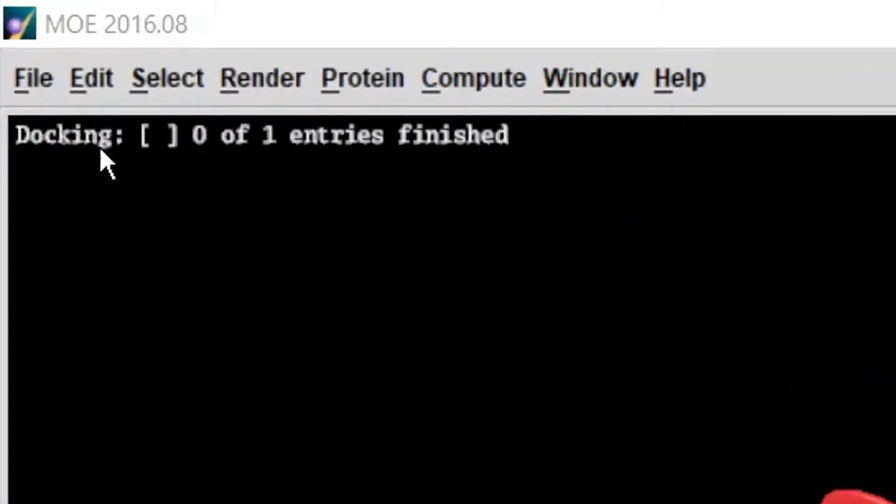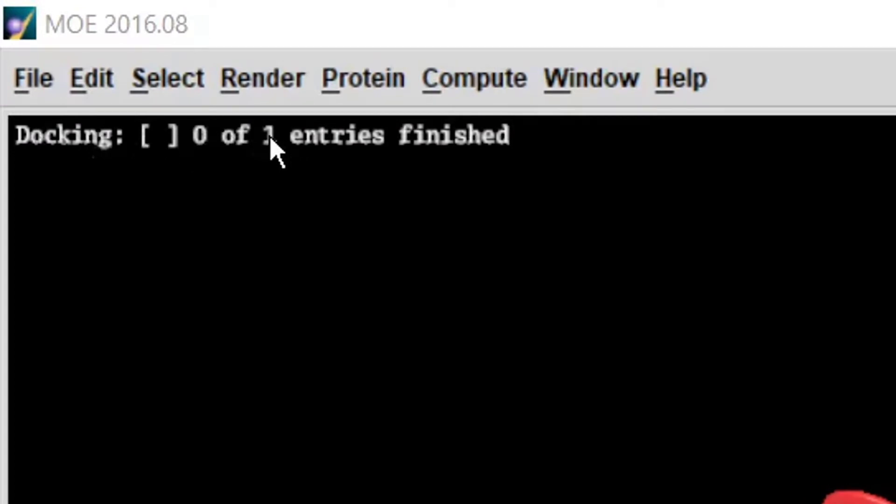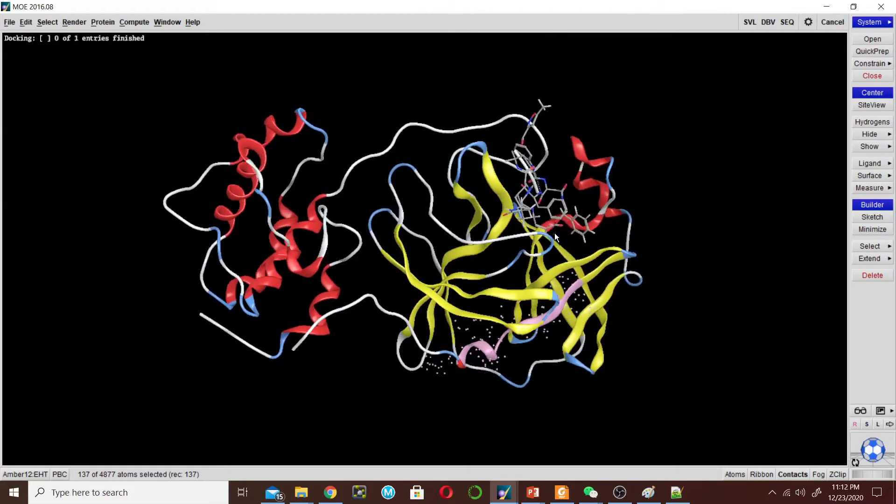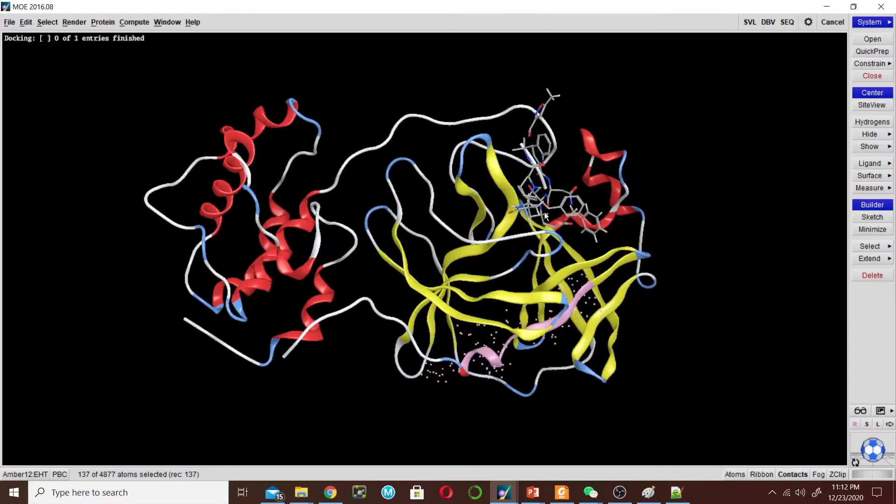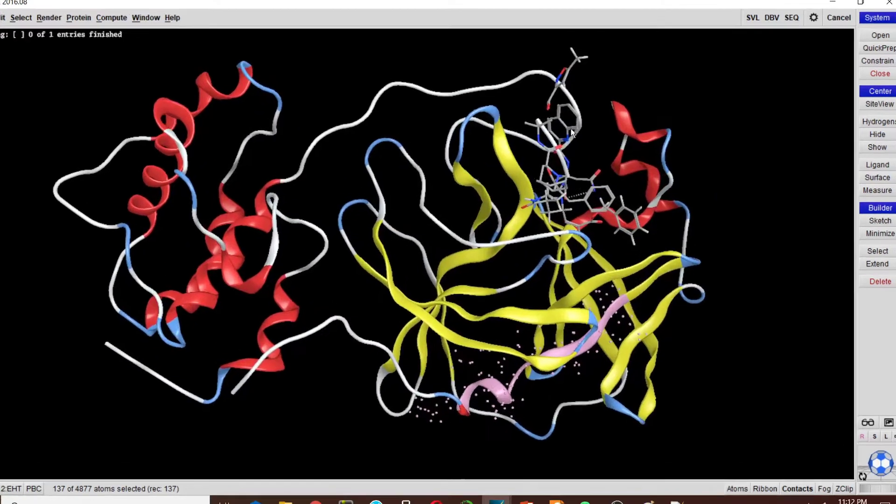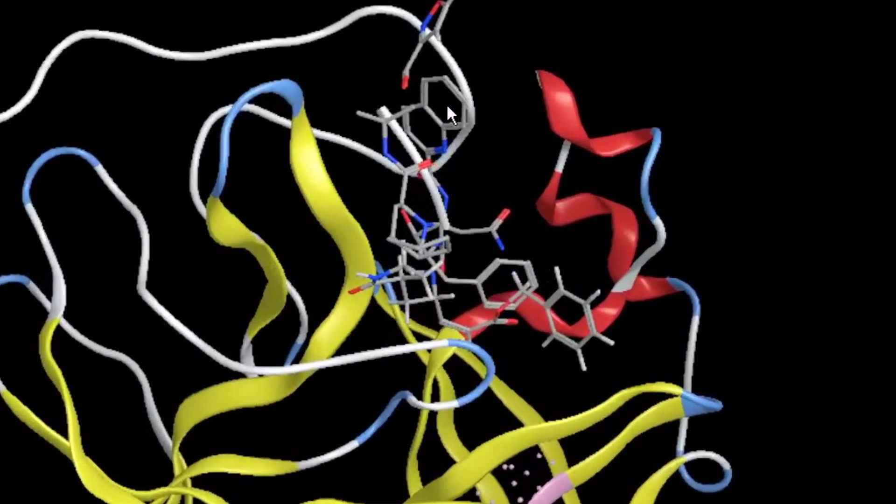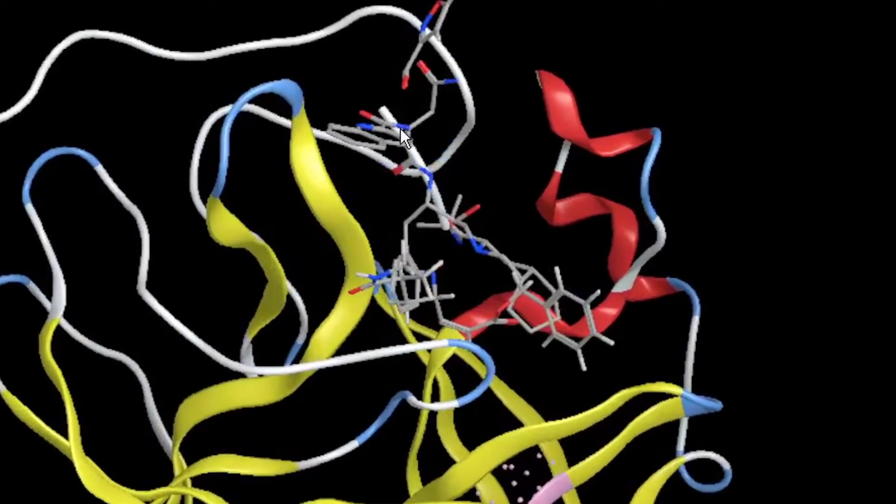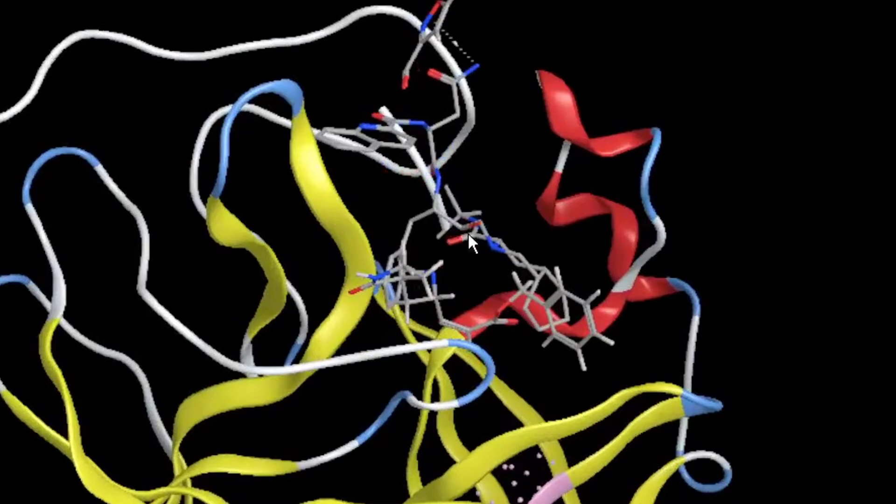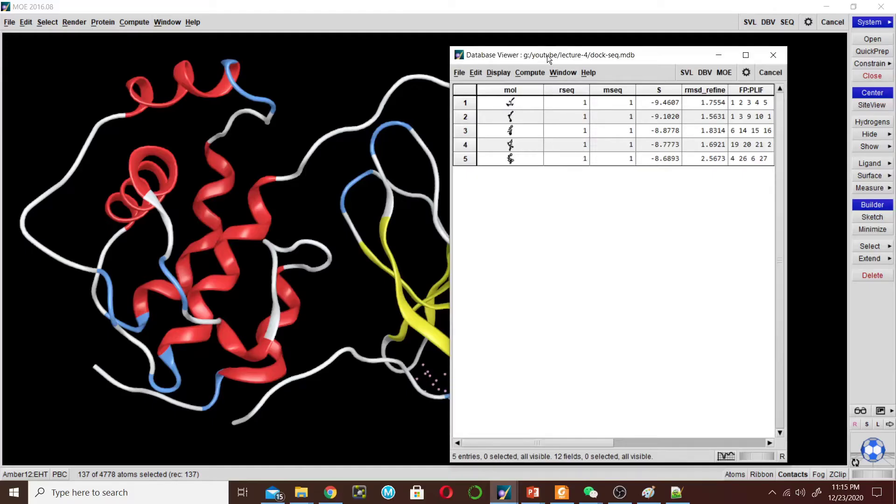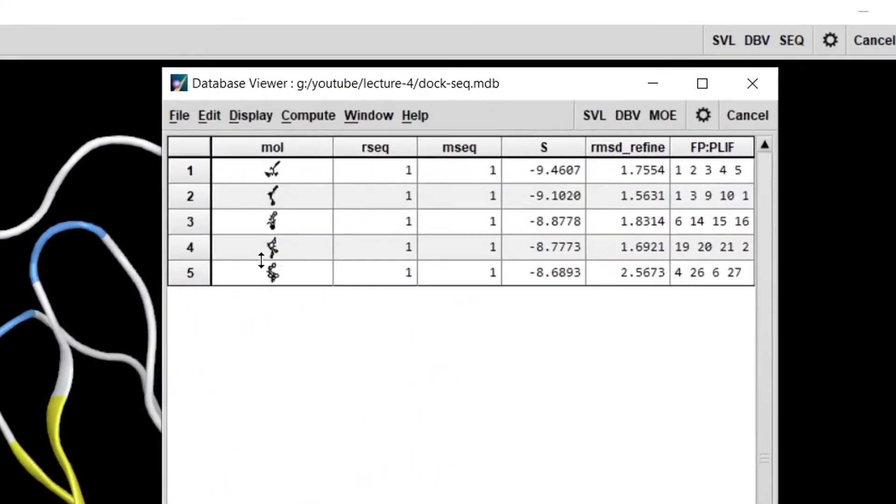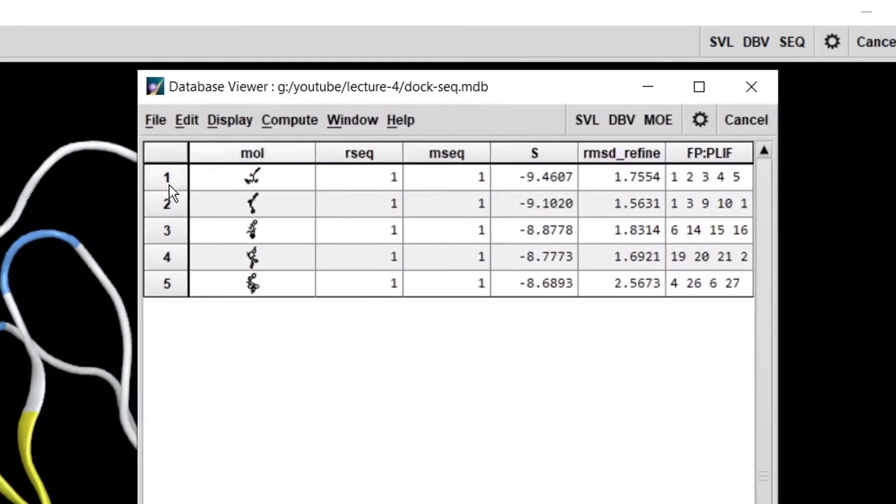Here it shows that MOE is docking one ligand. You can see that the ligand comes in 30 different poses. Now the docking is completed and it gave us five different conformations with their scores.